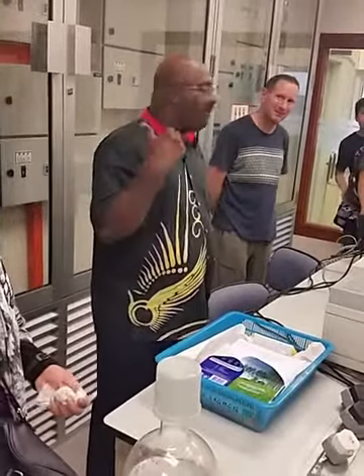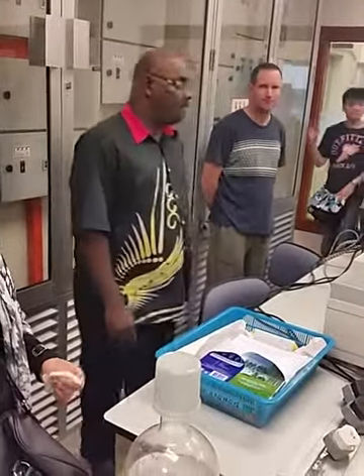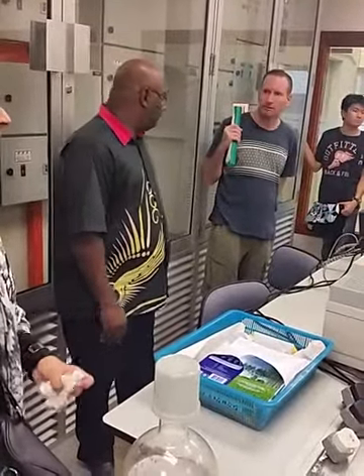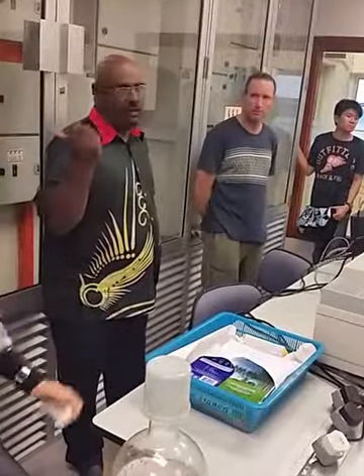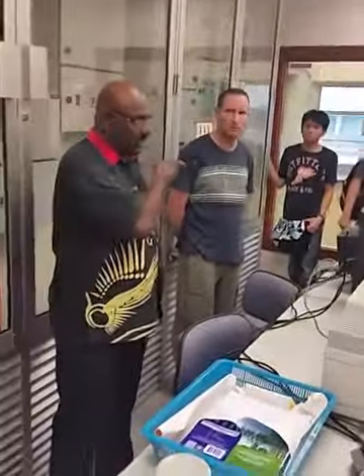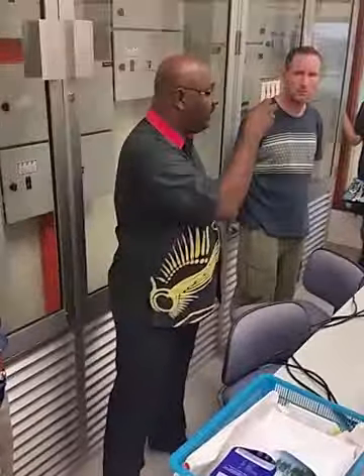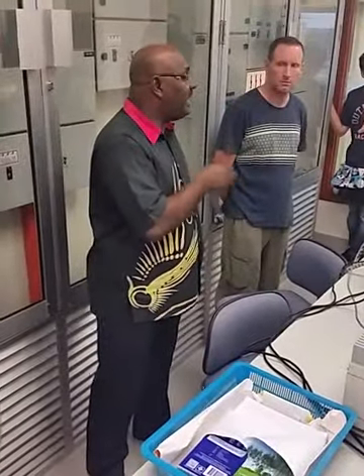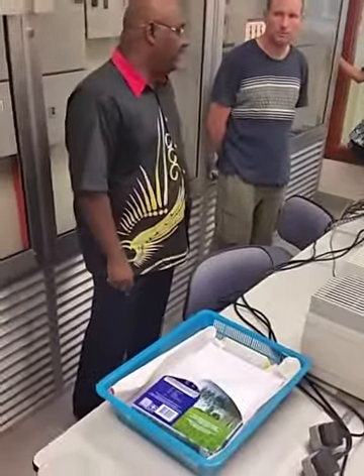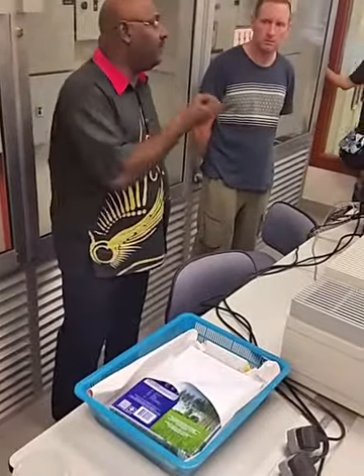This one costs nearly half a million. But this one we normally use for water samples. If you want to use it for a powder type of sample, you have to digest it first with acid, make it into a liquid form solution, then only you can introduce it. You cannot use powder form.